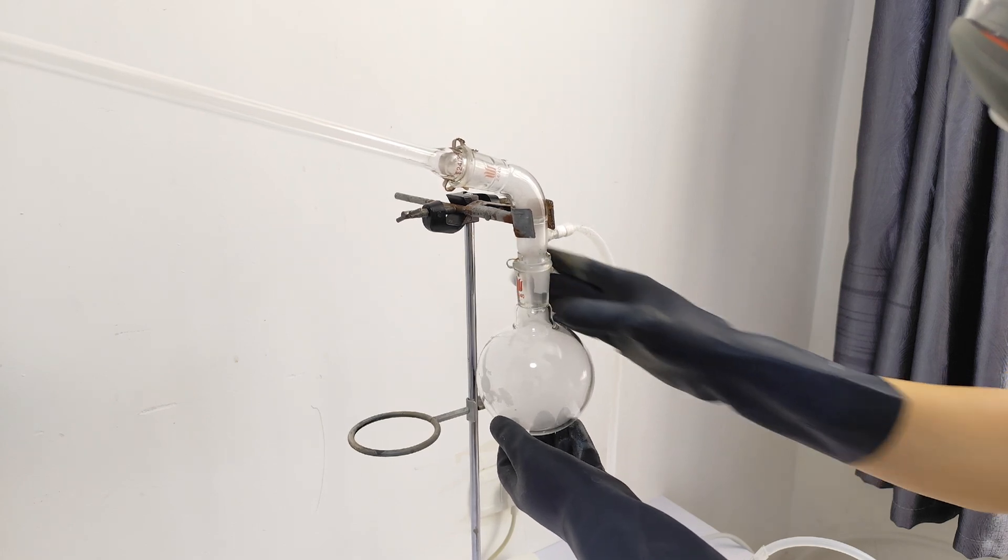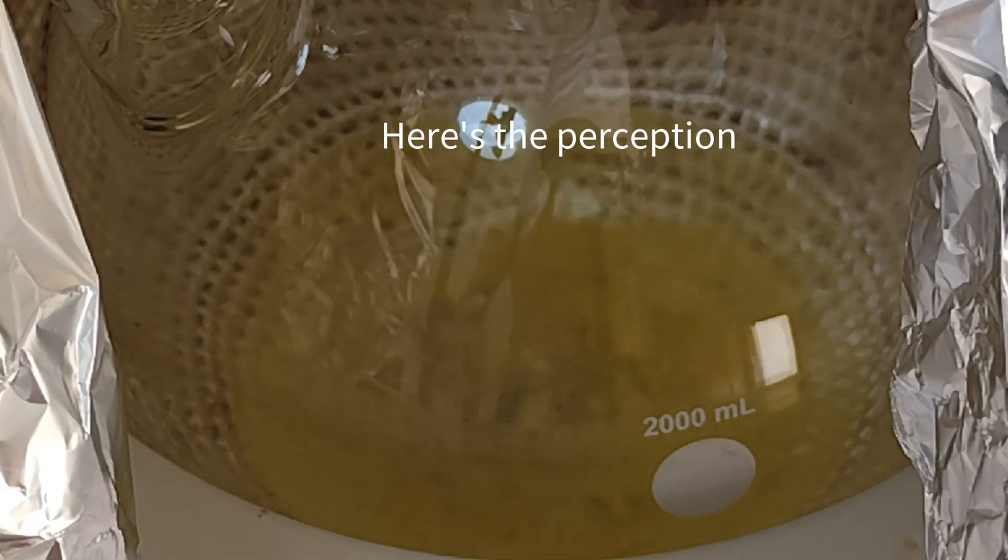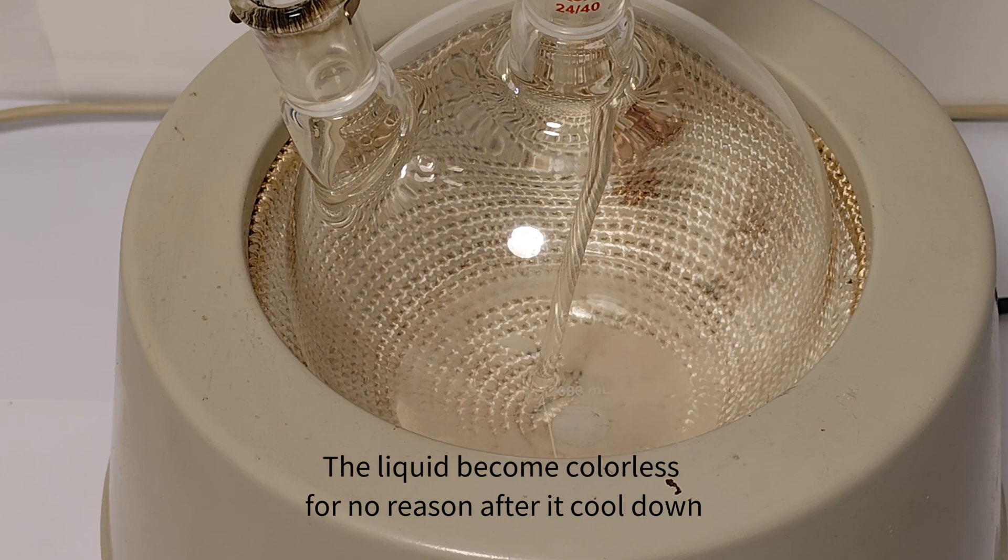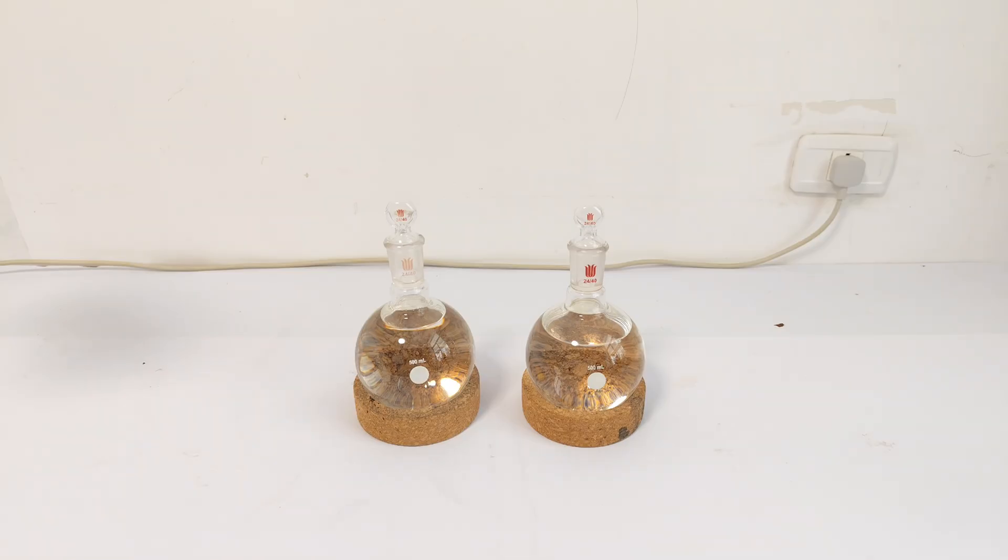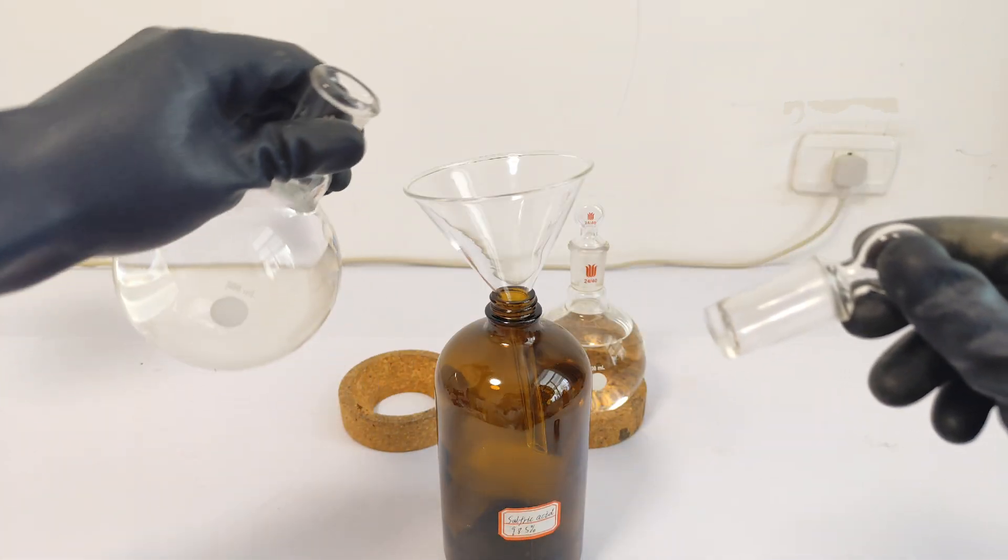After a few hours of distilling, what's left in the big flask is some lemon yellow liquid with some precipitate at the bottom, which I assume should be sodium sulfate. And to prevent the liquid from boiling away, I turned off the heater. What I finally got is two flasks of sulfuric acid, and the total volume is about 1L. So just pour them all in a brown bottle.